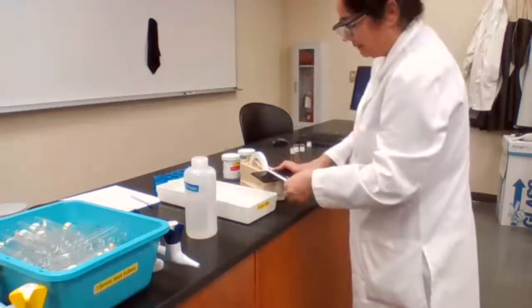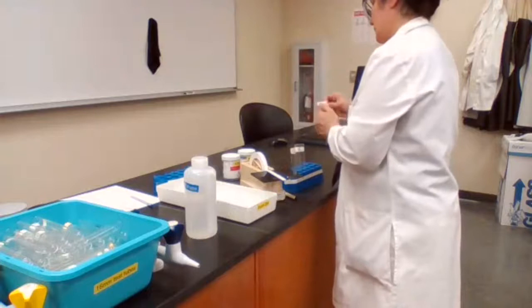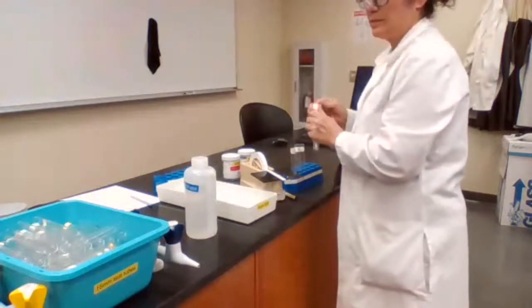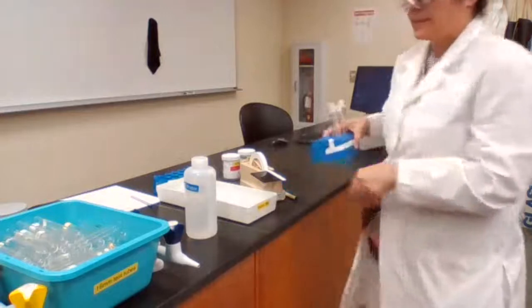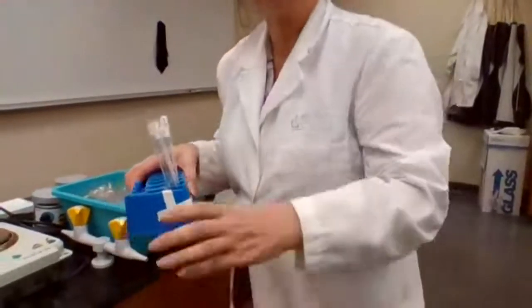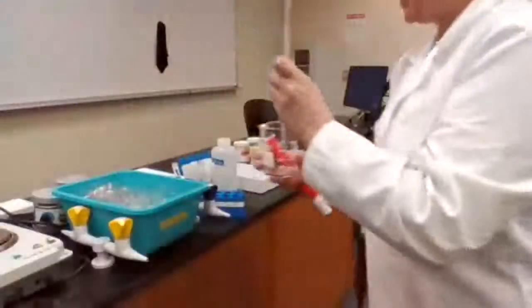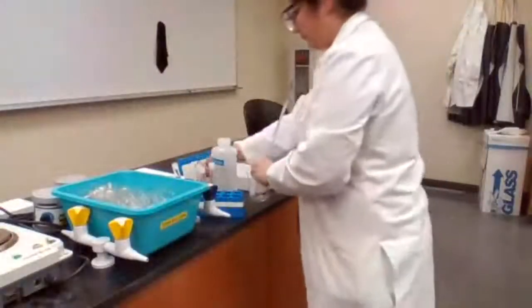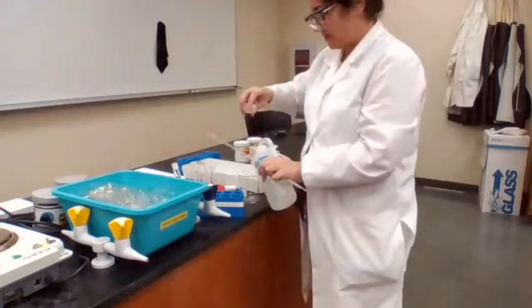And what's next? Next step, add 5 milliliters of distilled water to each test tube. So this cannot be approximate, it has to be exact because it's going to make a difference.